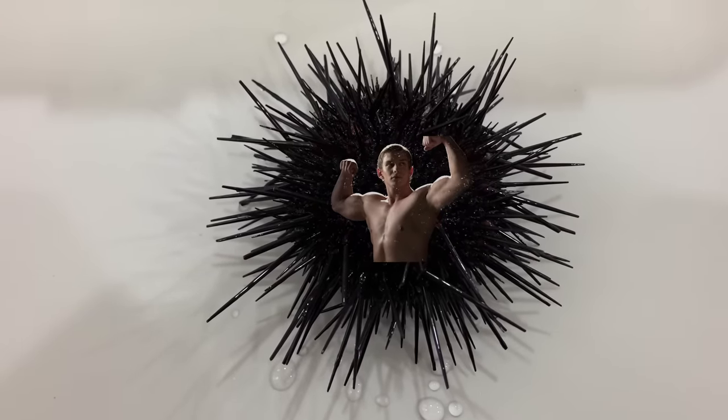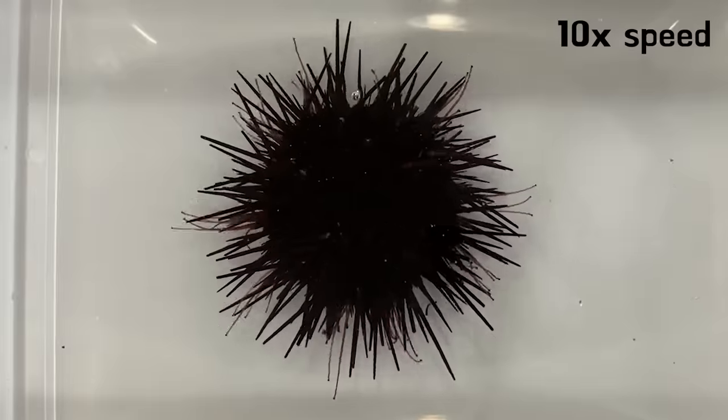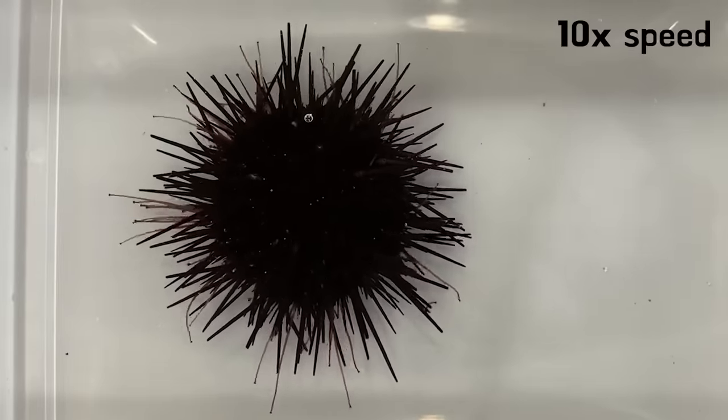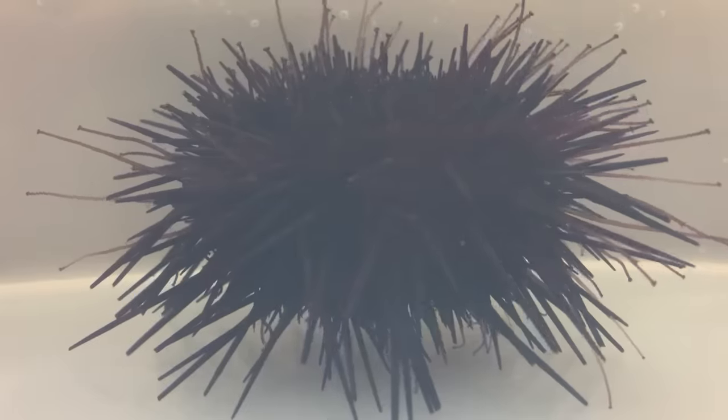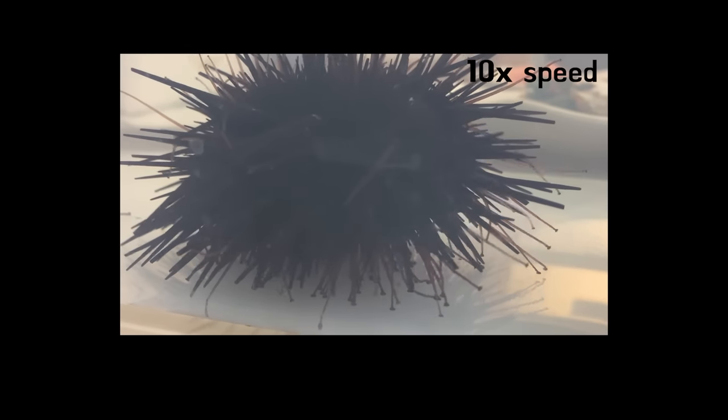Sea urchins have muscles under their spines, so they can move the spines too. They move their bodies using both tube feet and spines. Sea urchins move slowly, but faster than starfish.